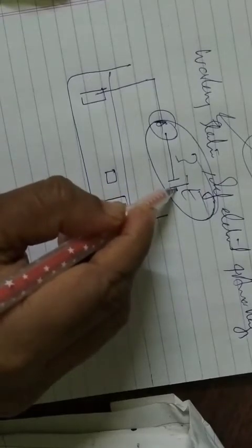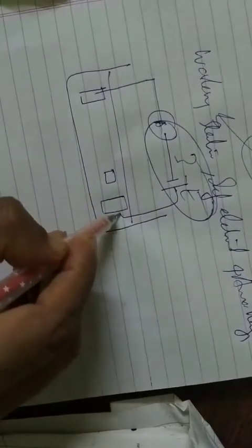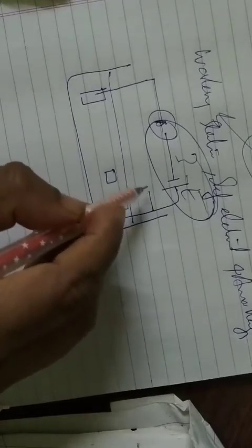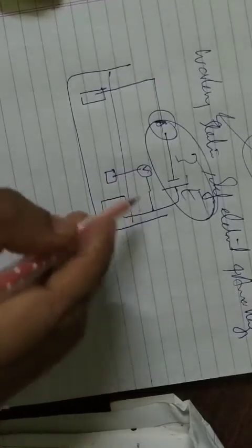If you see it this way, you take this one electrode, this another electrode, and this you can take as A. This is connected to a battery, and this is connected to a voltmeter.